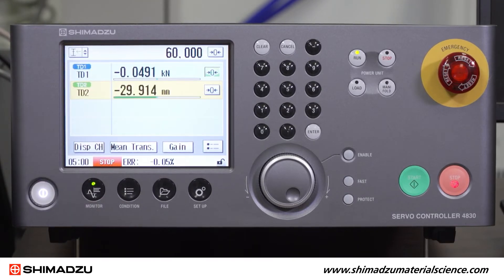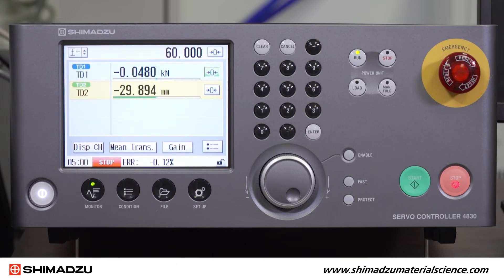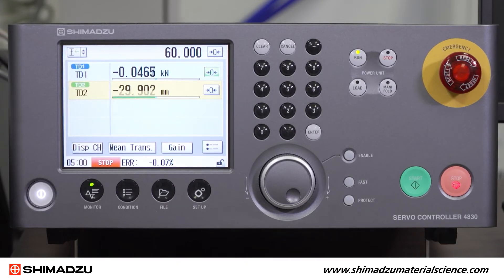If you happen to have an additional power unit controlling hydraulic grips or some other accessory, you can press Run 2.